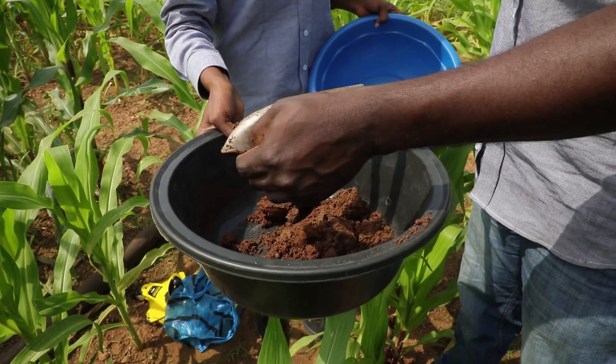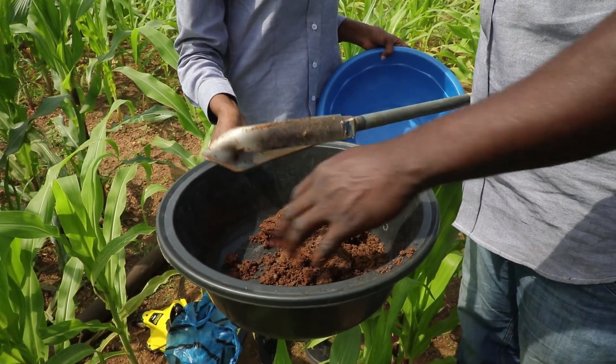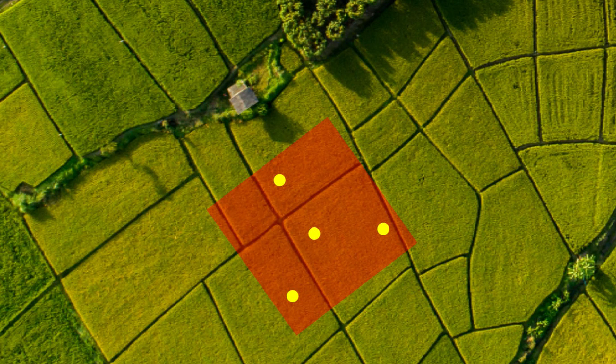Collect the topsoil from all four sub-sampling locations first. Then clean the auger, and then make another round collecting subsoil samples.